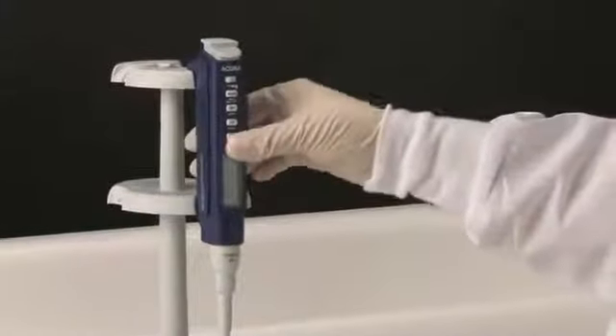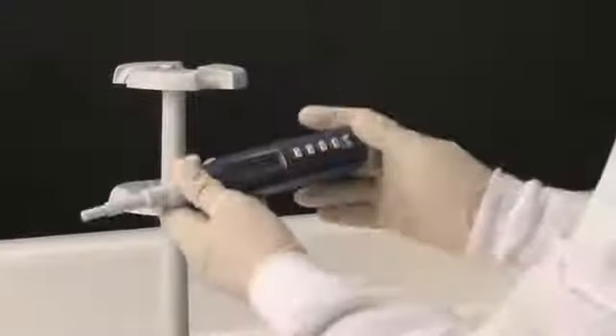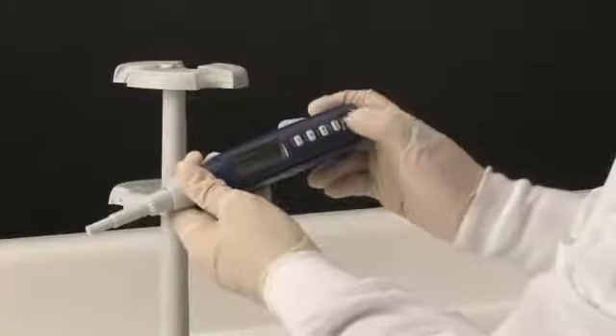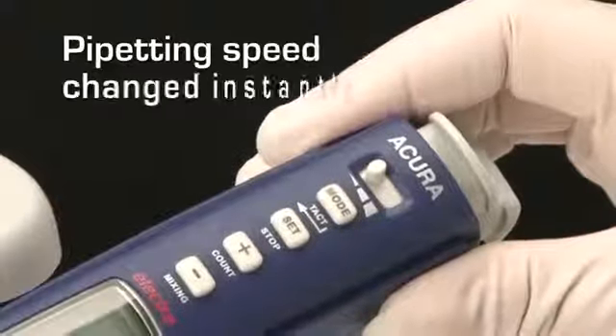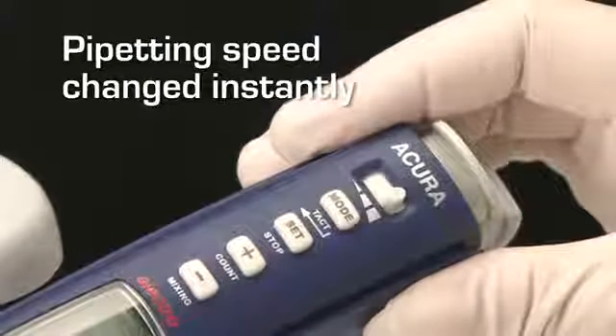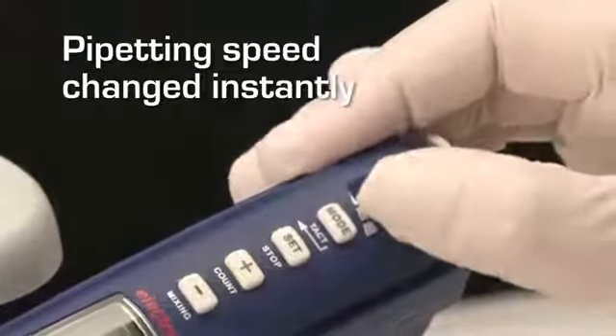Acura Electro Pipettes are designed and engineered to be comfortable, user-friendly, as well as easy to maintain. Three pipetting speeds can be selected quickly and easily. To change the speed before or during operation, simply move the selector to the right to increase the speed, or to the left to decrease it.